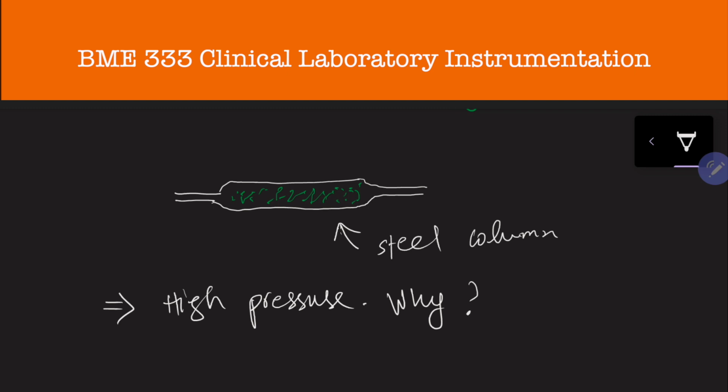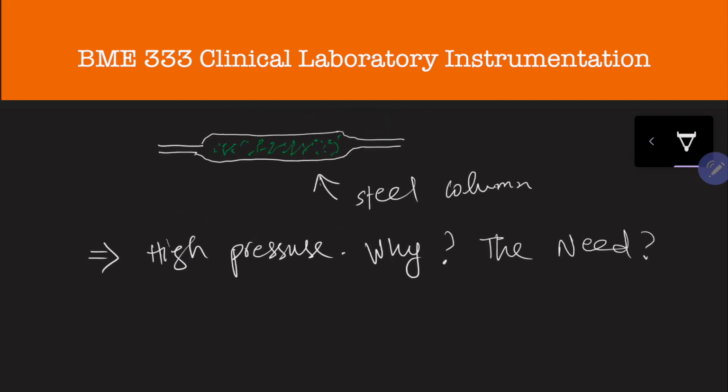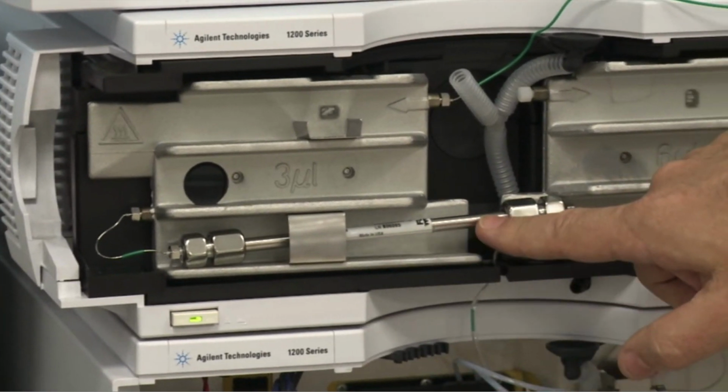That's what the issue is, that the stationary phase is so densely packed in the container that to get the liquid to pass through it at a realistic rate, we apply a very high pressure, so that we don't have to wait for eternity for our components to separate out, and we don't have to wait so long for all the components to come out.